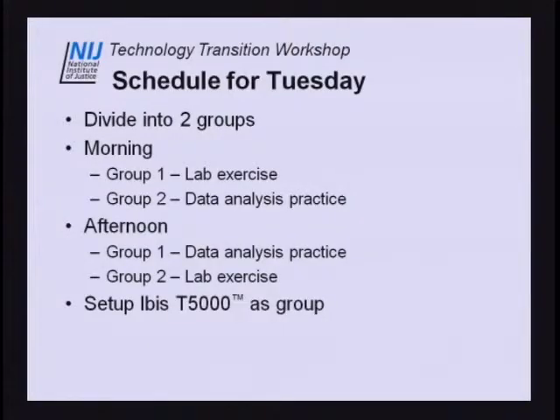So what's going to happen tomorrow is we'll start out here and we'll actually register plates as a group. Then we're going to divide you into 2 groups. One of you will come with me back to the labs and start the lab exercise. The others of you will remain behind and get data analysis practice on computers with Tom. Then we'll switch in the afternoon so that both groups get to do both activities. And then in the afternoon, after group 2 is done, we'll actually set up the T5000 as a group. And then on Wednesday, you'll analyze the plates that you guys actually made using the software again.